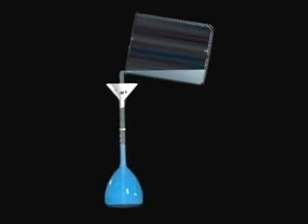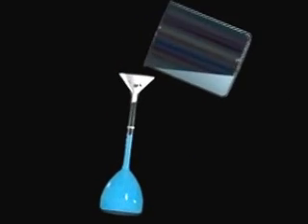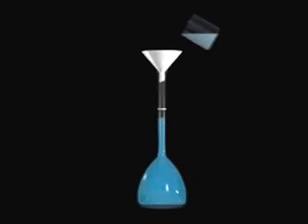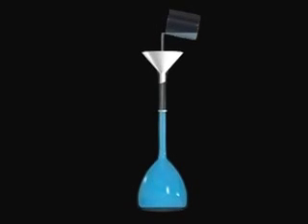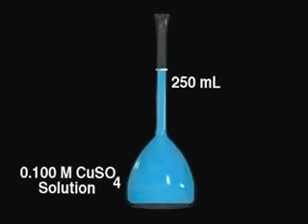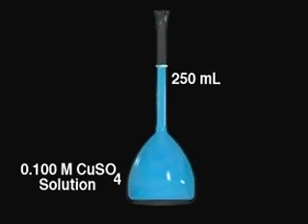We then add water and swirl the flask to ensure good mixing with the added water. More water is added to bring the volume to the mark on the flask that indicates precisely 250 milliliters. We now have our final solution of 0.100 molar copper sulfate.